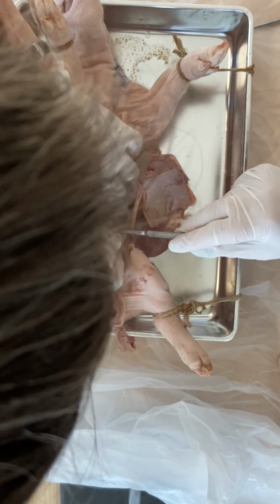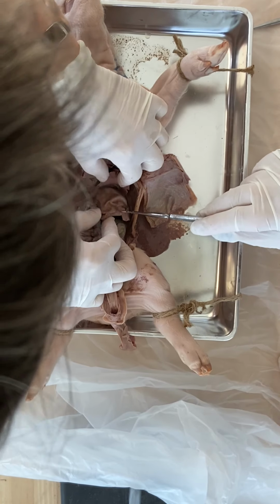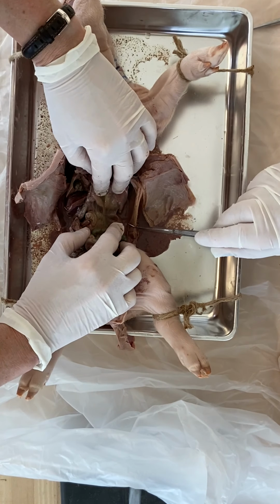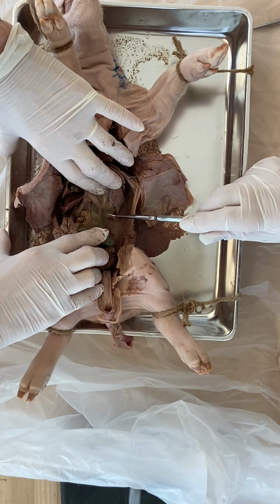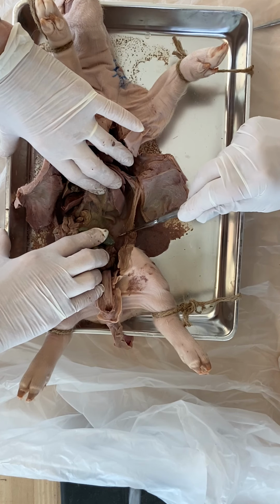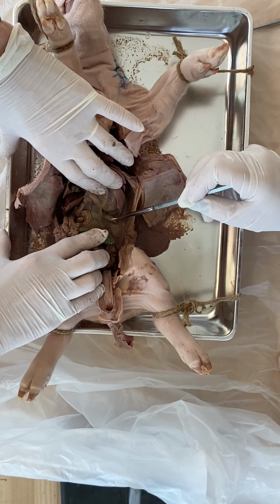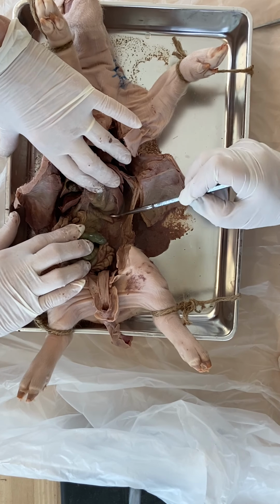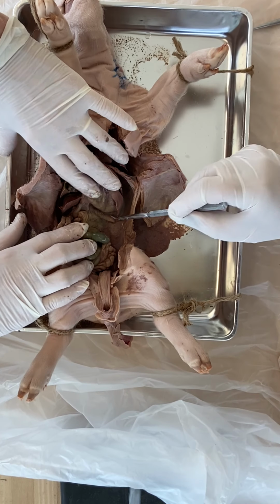Or else maybe it was this and it's just degraded. But it should be obvious. There it is. Okay, so there's the pancreas under here. If I break the membrane, we'll be able to see it much better now. So here's that one end, there's the tail. We can see it really nicely now. Here's the tail up here, feeding into the top of the small intestines.